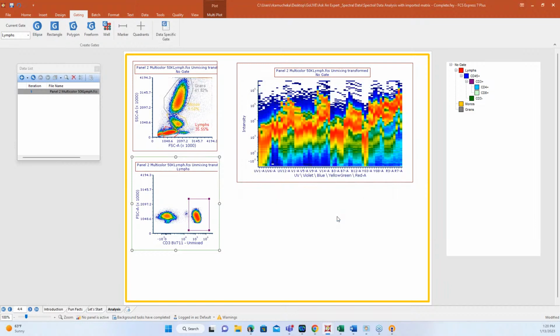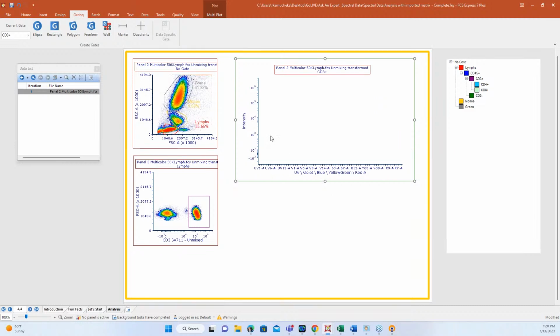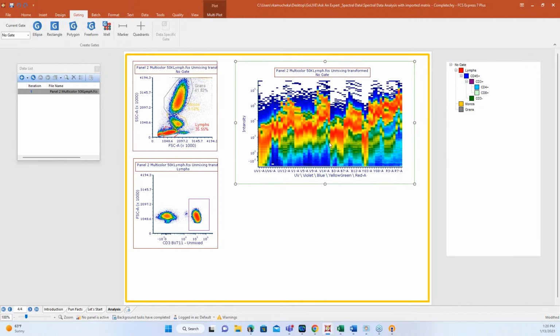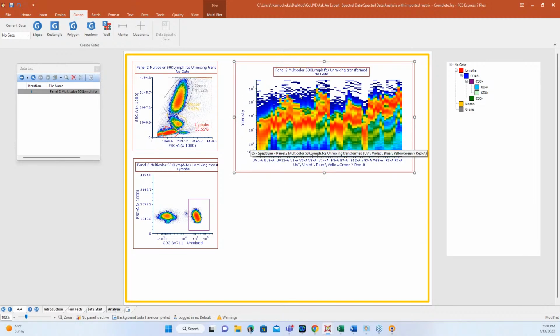So we'll do CD3 positive there. Then I can drag and drop. And let's see, what did I do here? Huh, that's unusual. But somehow I have found a way to change this. Oh, I think it's because of the way that I created that gate there, but we're going to revisit that in just a second.